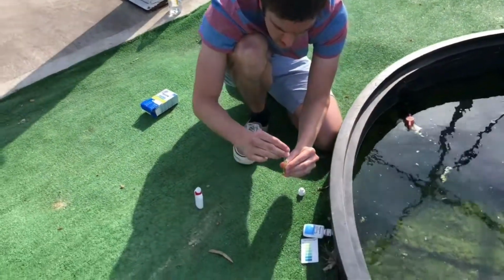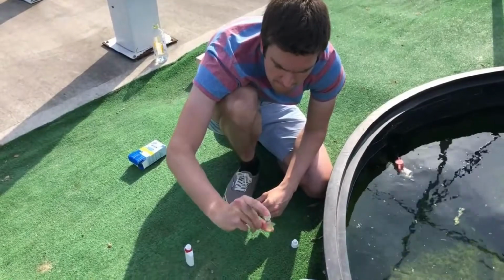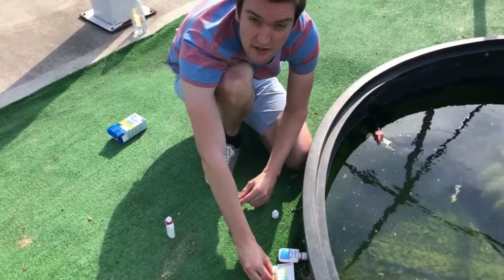Place the cap back on. Again, invert the sample 5 times. And then leave the sample for 3 minutes to determine the level of phosphate.